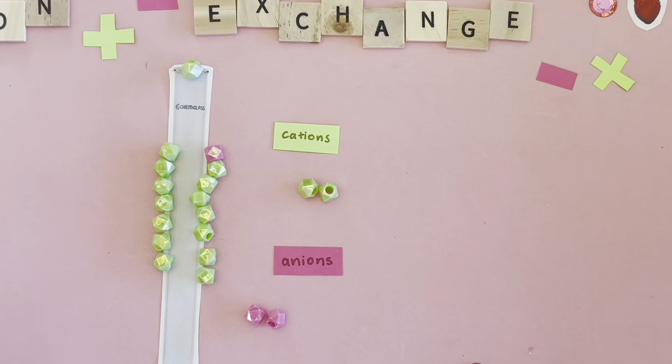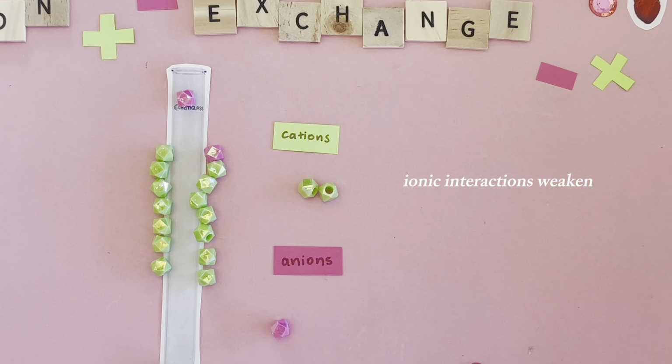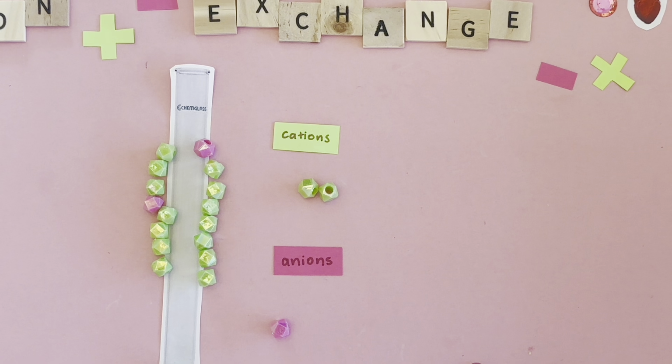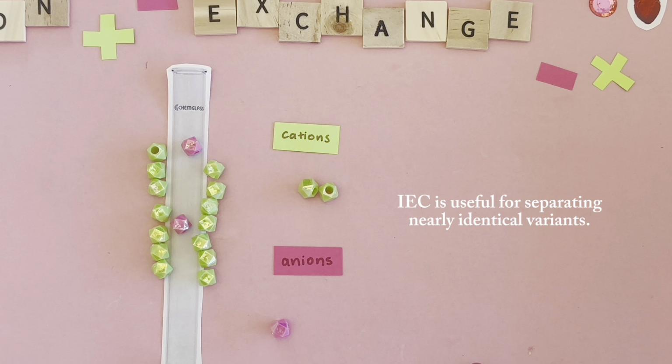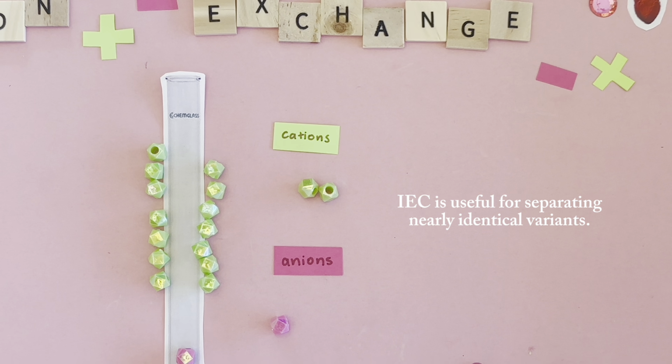To get everything off the column in a controlled way, the salt concentration or the pH is slowly changed. As this happens, the ionic interactions weaken and proteins elute in order of how strongly they were held. Because even small differences in charge can change how long a protein stays on the column, IEC is great for separating variants that look almost identical by other methods, like different glycoforms or slightly modified proteins.